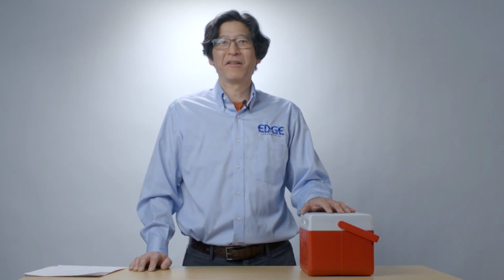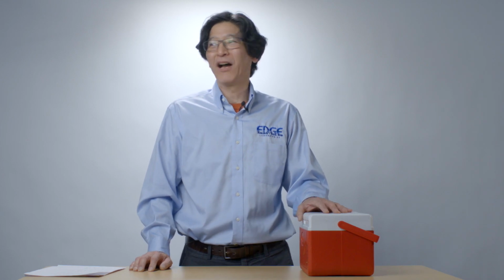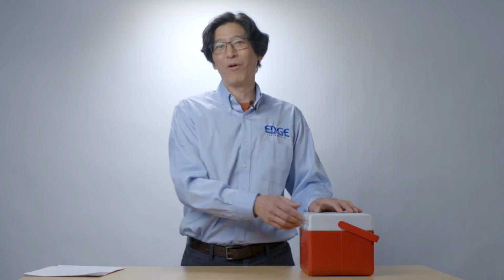Hello, my name is Hiro Yamamoto and I'm from Edge Analytical Laboratories, and today I'm going to make a little demonstration of how we obtain a VOC water sample.